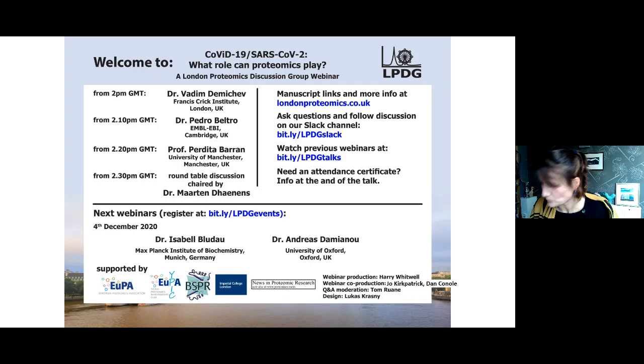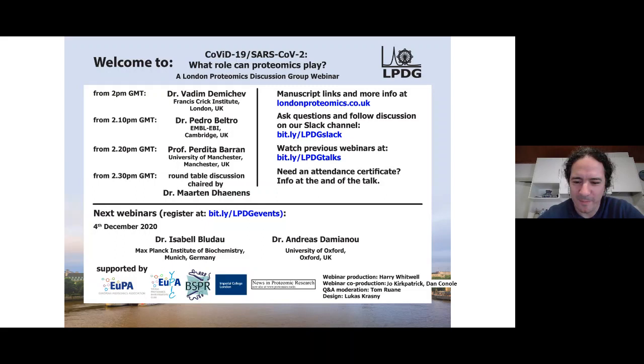Pedro, do you have anything to add to this? No, not really. I mean, you always have to compare with other potential technologies. And again, I'm probably a bit less focused on MS than more people here, although we primarily work with proteomics data sets. But it always has to be a balance between what's possible to measure and ease, cost, and all these different things.